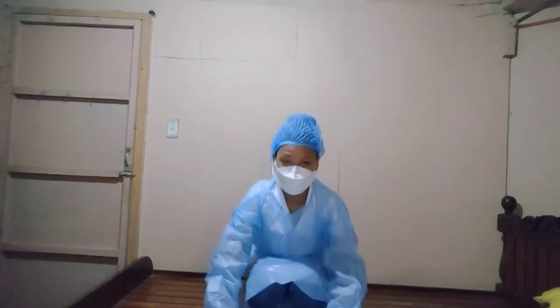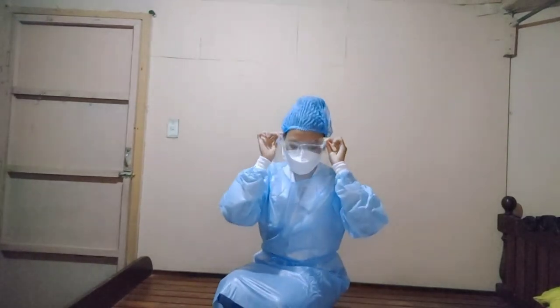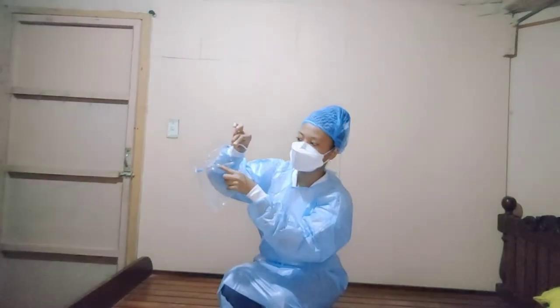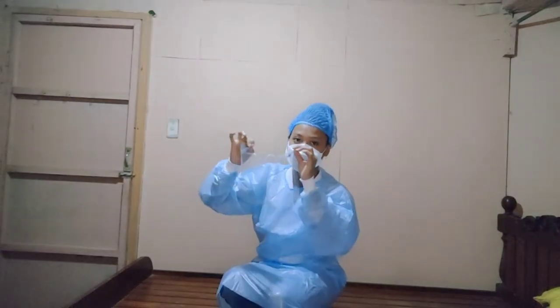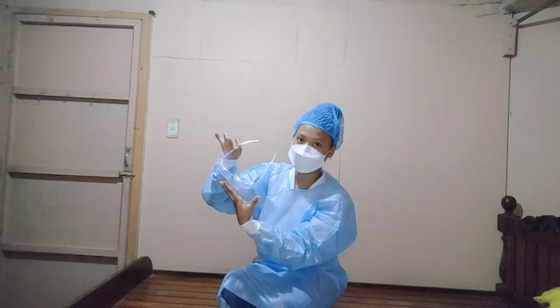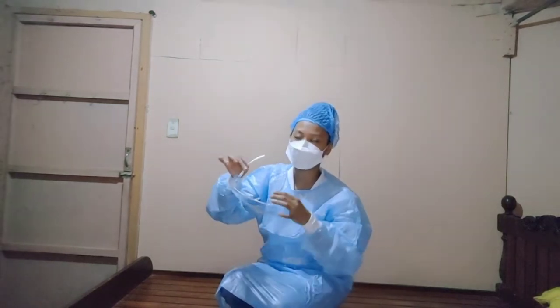Next, we have protective eyewear equipment. I have here my face shield — I don't have goggles, so I'm using the face shield as an alternative. Make sure the nose part is on top of the mask. When you wear the face shield, hold it on the sides, not on the front, because there may be microorganisms present on the front surface.